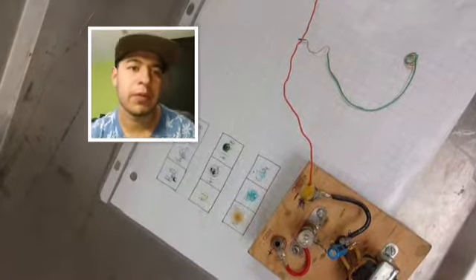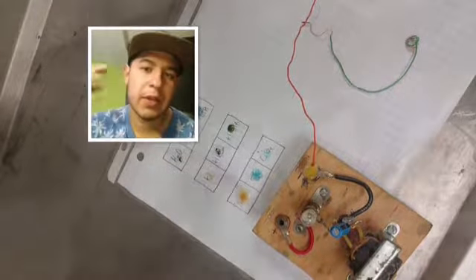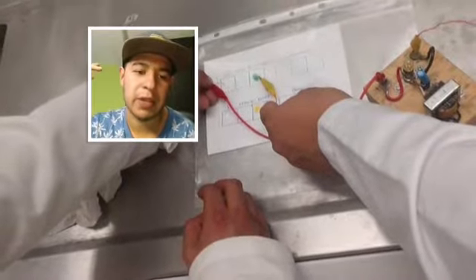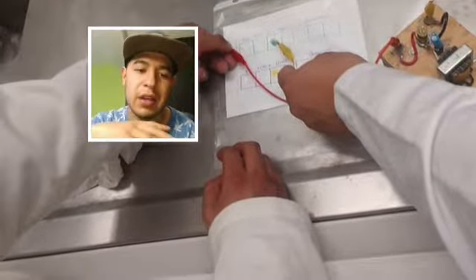Well, let me talk about the practice on redox reactions and electrical cells. The objective of this was to understand that oxidation and reduction can be observed, recorded, and to be able to write the semi-reactions, and to analyze operations in the breath analyzer.